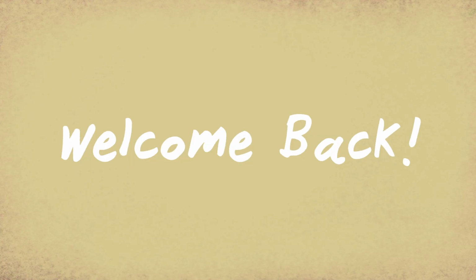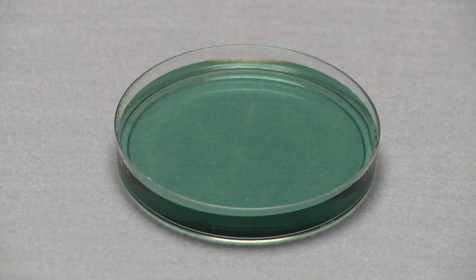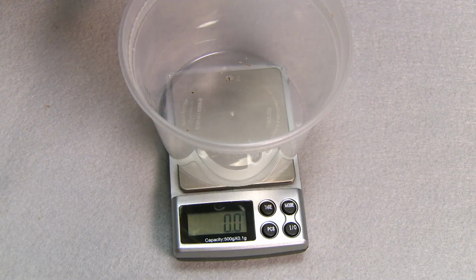Okay, let's start our investigation and see if your predictions were right. Before mealtime for the mealworms, make sure you've got your scale, your potato, your BTB, and the stars of this investigation, the mealworms. We start by weighing our worms.